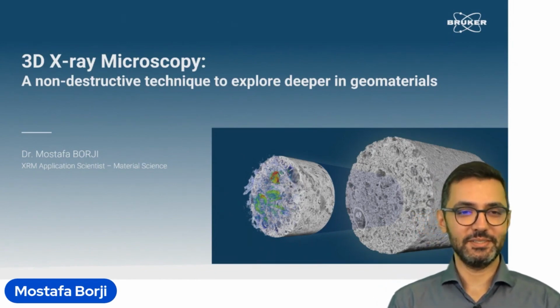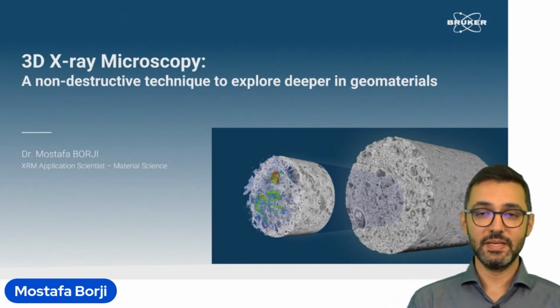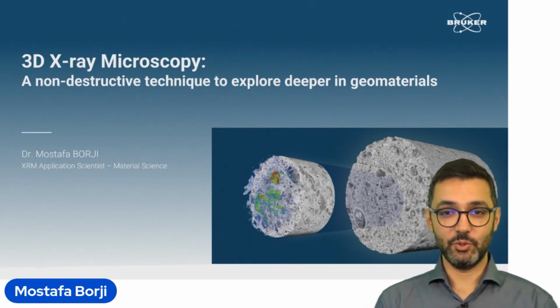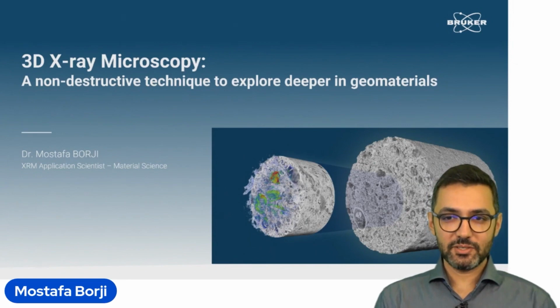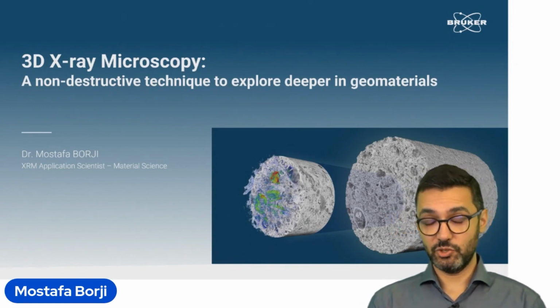As Chairman mentioned, I am presenting this webinar live from the Bruker XRM application lab located in Kontich, Belgium. This webinar is about 3D X-ray microscopy and its application in geosciences.